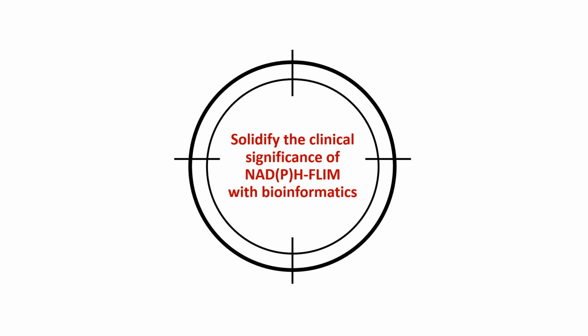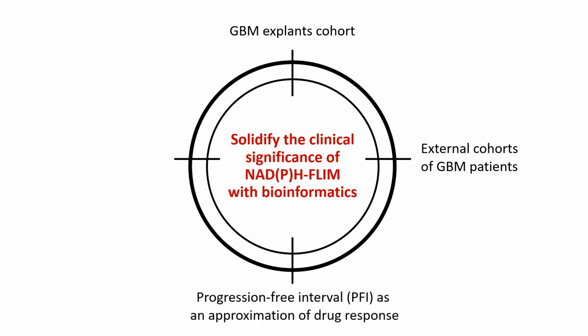Our aim, therefore, is to solidify the clinical significance of this imaging technique. To do this, we exploited both a cohort of glioblastoma samples collected in our laboratory and an external cohort of glioblastoma patients with matched clinical data. In particular, among clinical variables, we leveraged progression-free interval as an approximation of drug response. Finally, to further validate our approach, we developed a predictive model based on the FLIM-derived information.